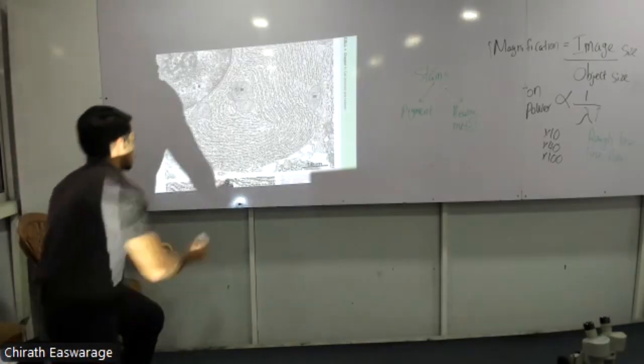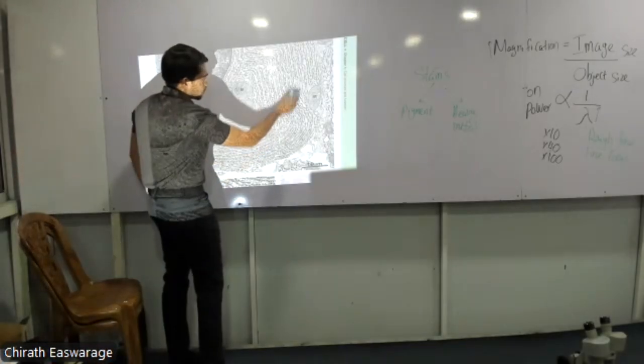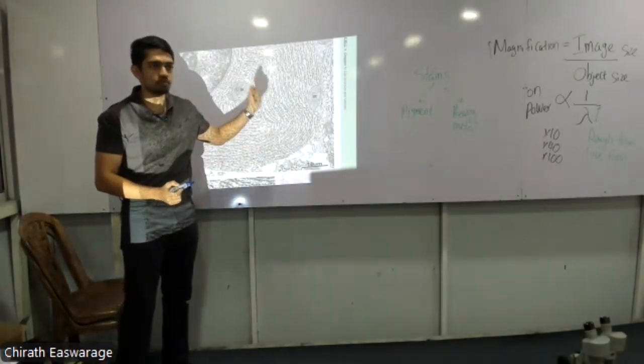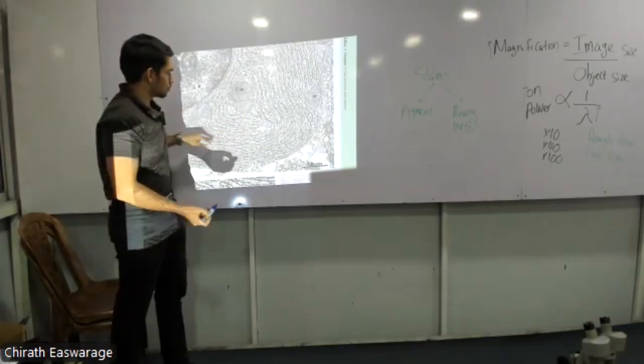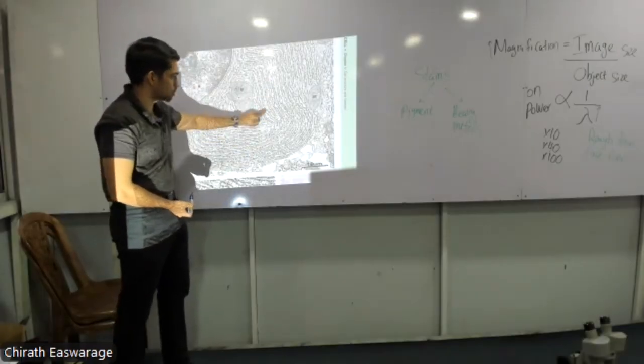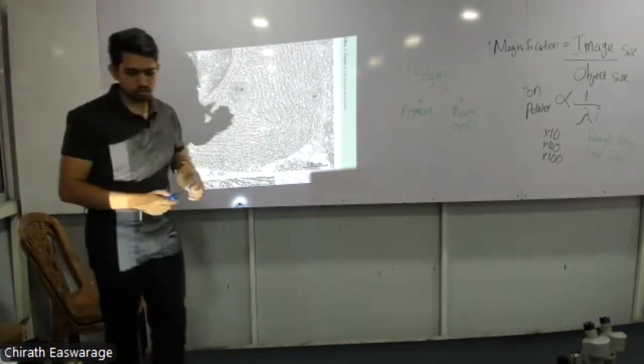Ribosomes are the many dots, right? Those are our protein making factories, right? So the rough endoplasmic reticulum has ribosomes stuck to the membrane. Can you see dots? Those are ribosomes.